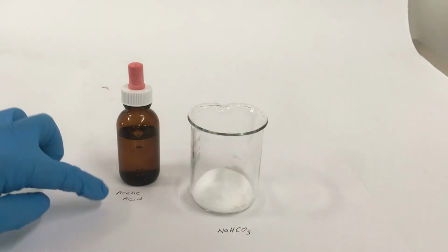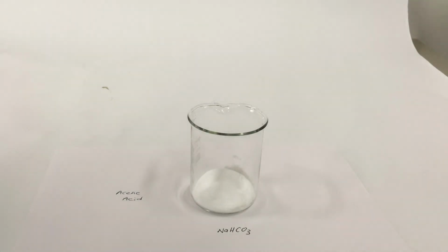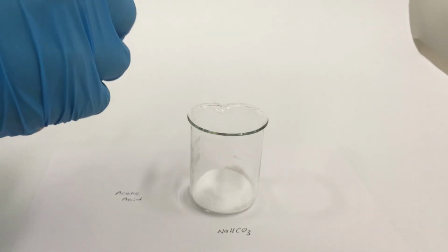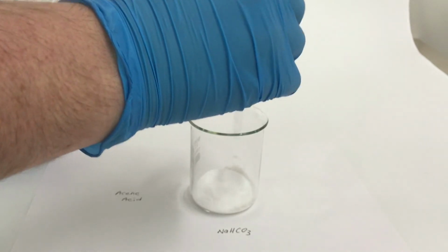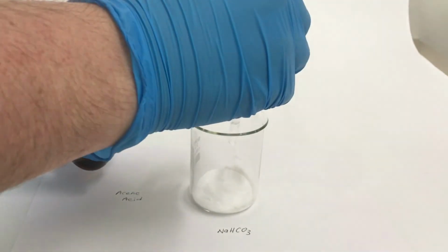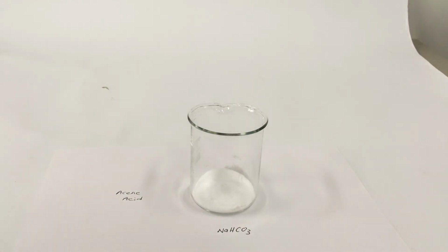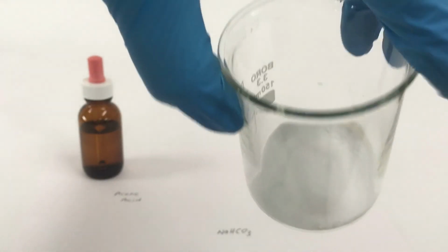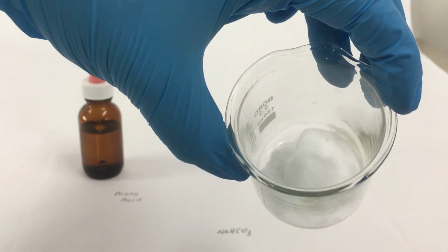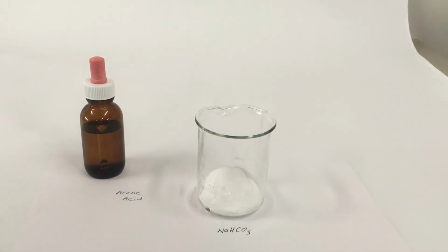Okay, so we're going to test a reaction here between acetic acid and sodium hydrogen carbonate, or baking soda, more commonly known. So we should be able to see, hopefully, a bit of effervescence here. Add a bit of water, we can actually get it to react.